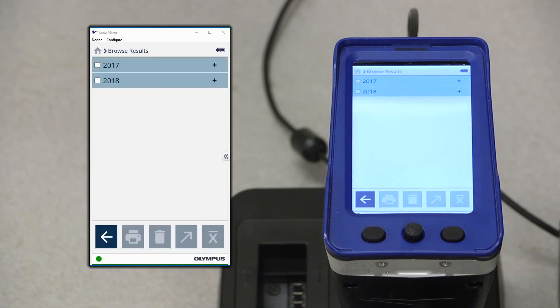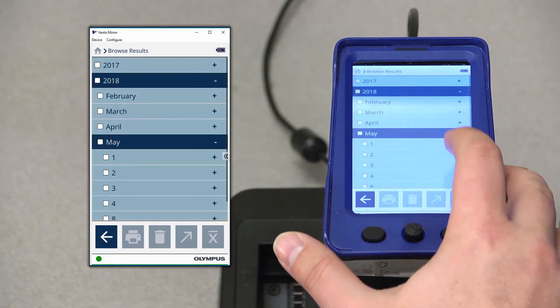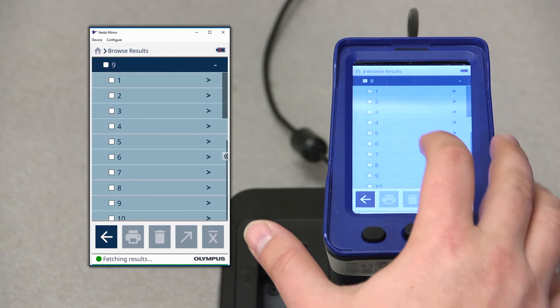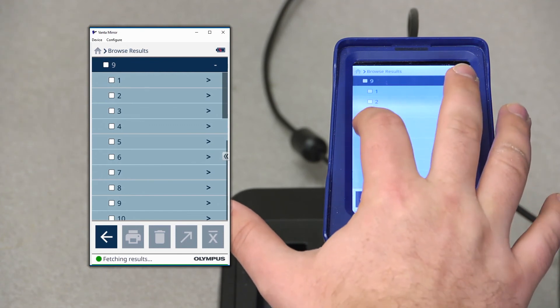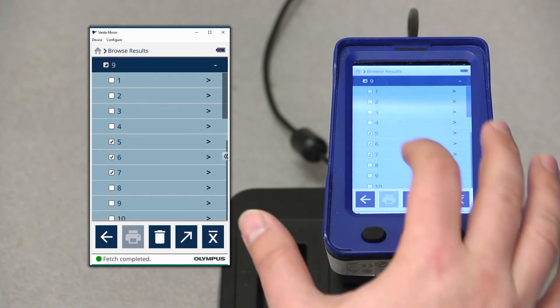In here, the results are organized via date and test result number. Simply use the drop downs to select the date and results that you wish to average. Select them with the checkboxes to the left-hand side.